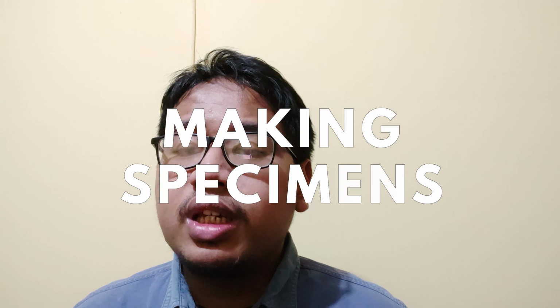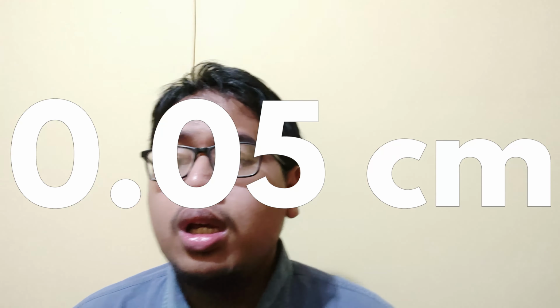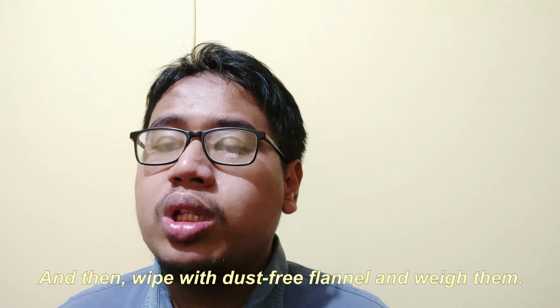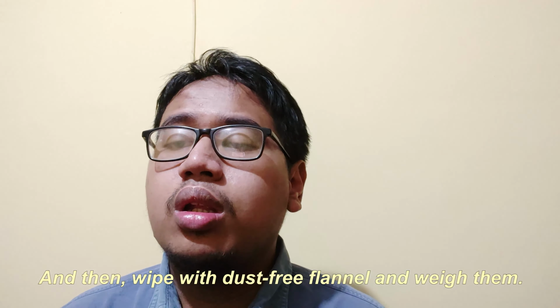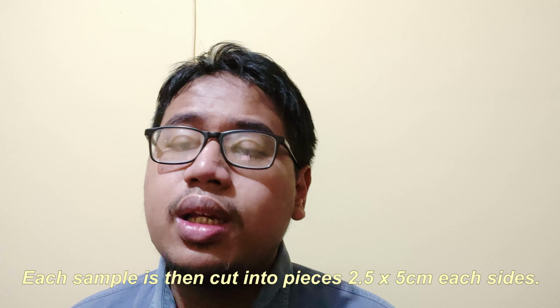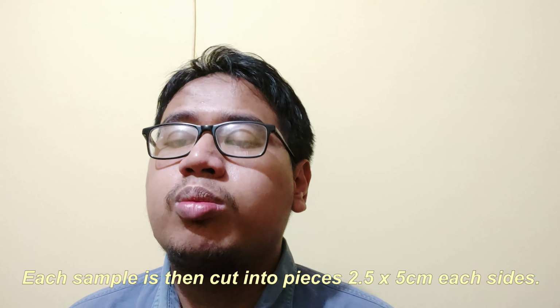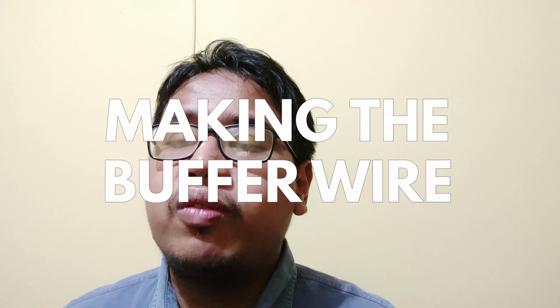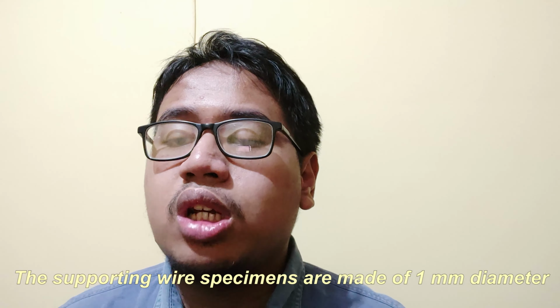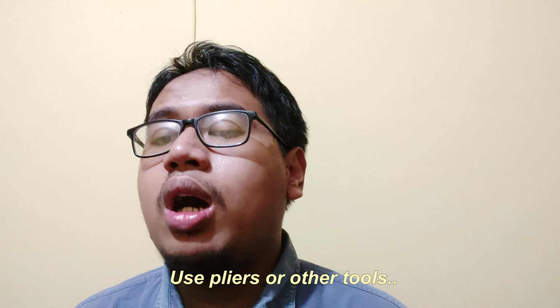And then the third one is making specimens. Plastic samples were cut into a size of 10 × 10 × 0.05 cm. Then the practitioner wipes them with a dust-free flannel and weighs them. After that, the practitioner records the sample weight, and each sample is then cut into pieces of 2.5 × 5 cm in size. And then the fourth one is making the support wire. The supporting wire specimens are made of 1 mm diameter steel wire, using pliers or other tools.